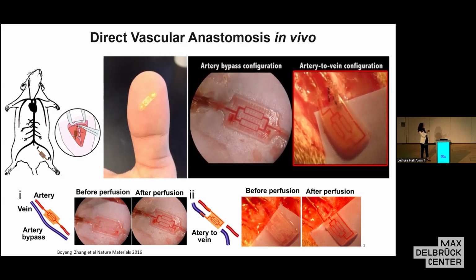And you can see that when we let the blood flow, there is no thrombosis. Everything looks pretty well. Interestingly, you don't need endothelial cells for this to happen. The polymer itself is pretty good because it has citric acid, which probably partly acts to inhibit platelets because it chelates calcium.